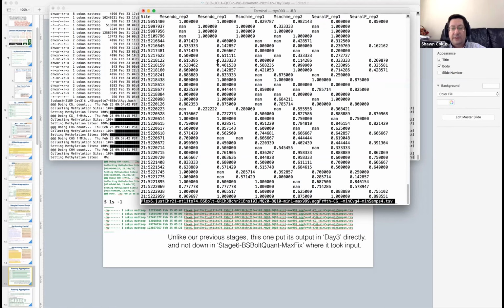And now you can see there's also missing data, because we allowed up to 2 guys to be missing, right? So some rows should have no missing data, right? So 1, 2, 3, 4, 5, 6, that guy is complete. We had our threshold of what? It was like 4 coverage or something. That's the coverage we had. Some guys will be missing 1.